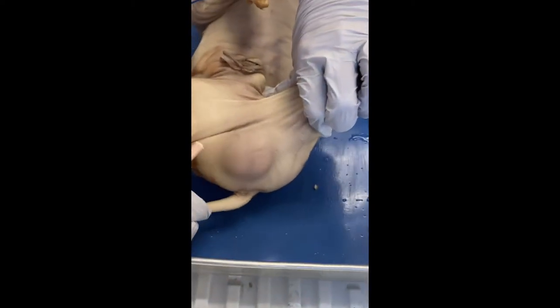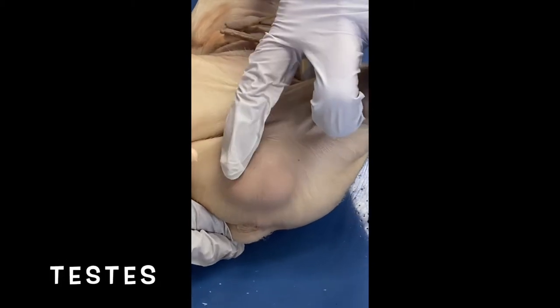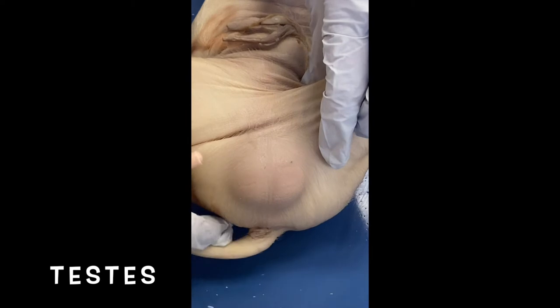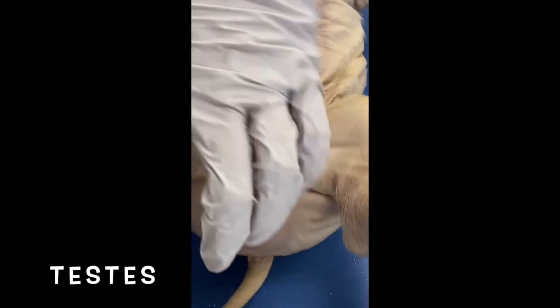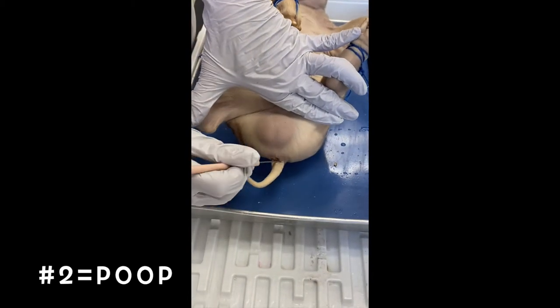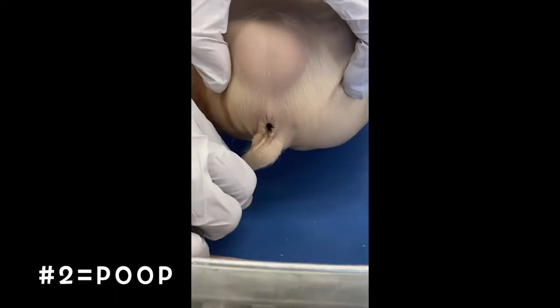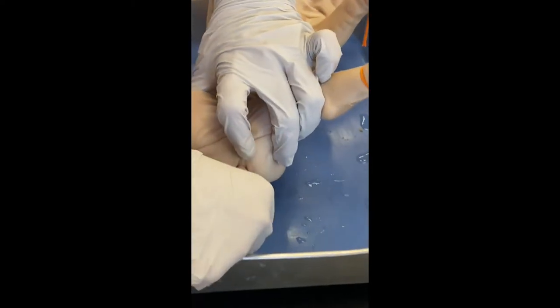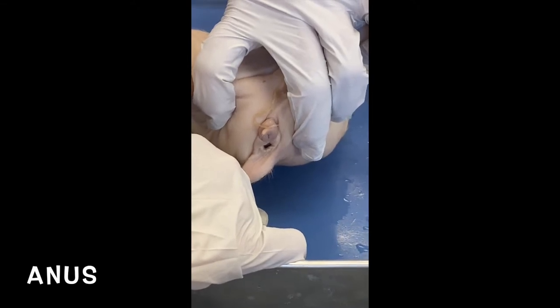And our male is here. You guys can laugh at home. There's not a urogenital opening here. What we see is a scrotum, and these are two testicles, which we will show you when we dissect. Very different. I forgot to point out, they both have where they go to the bathroom, number 2, for their waste. There is the anus right below the tail. Same thing on a female. Go back here, just show you hers. Can we see that? Absolutely. There's her anus, right above her urogenital opening.